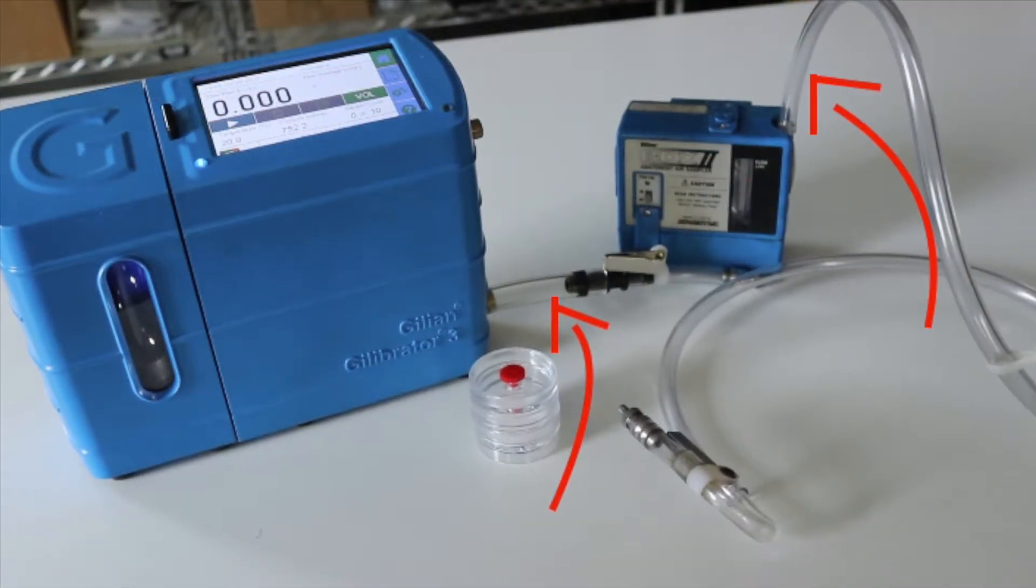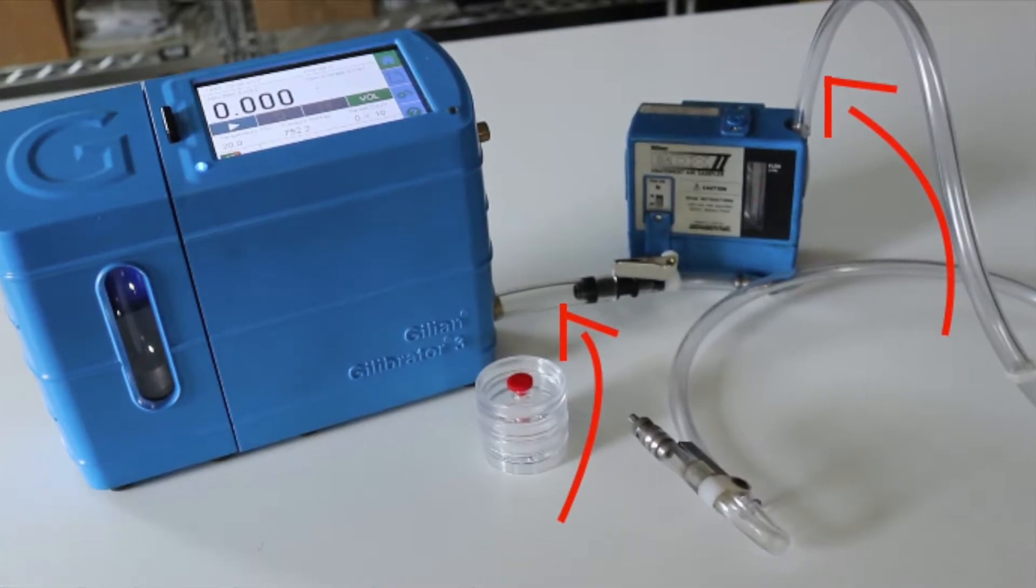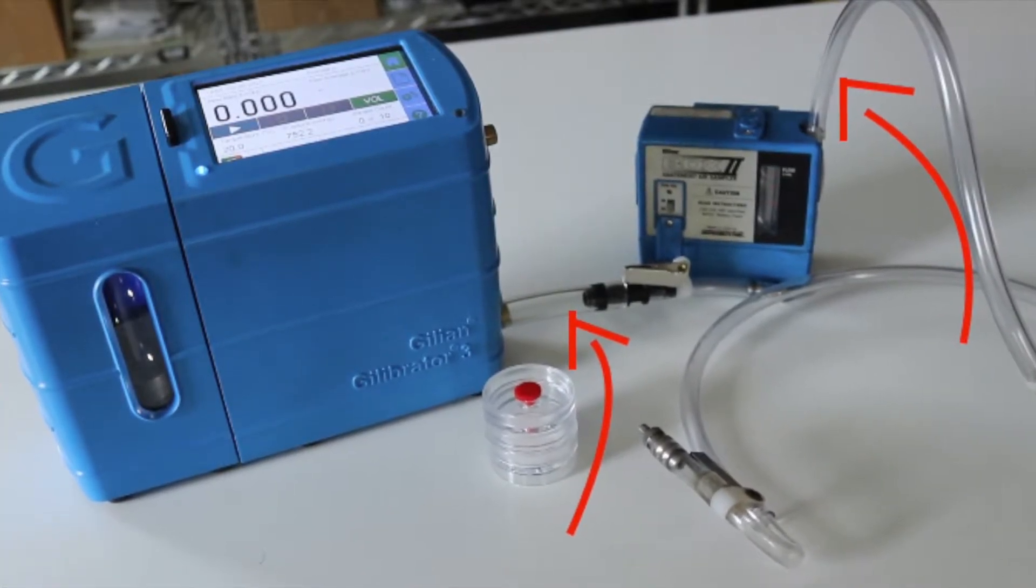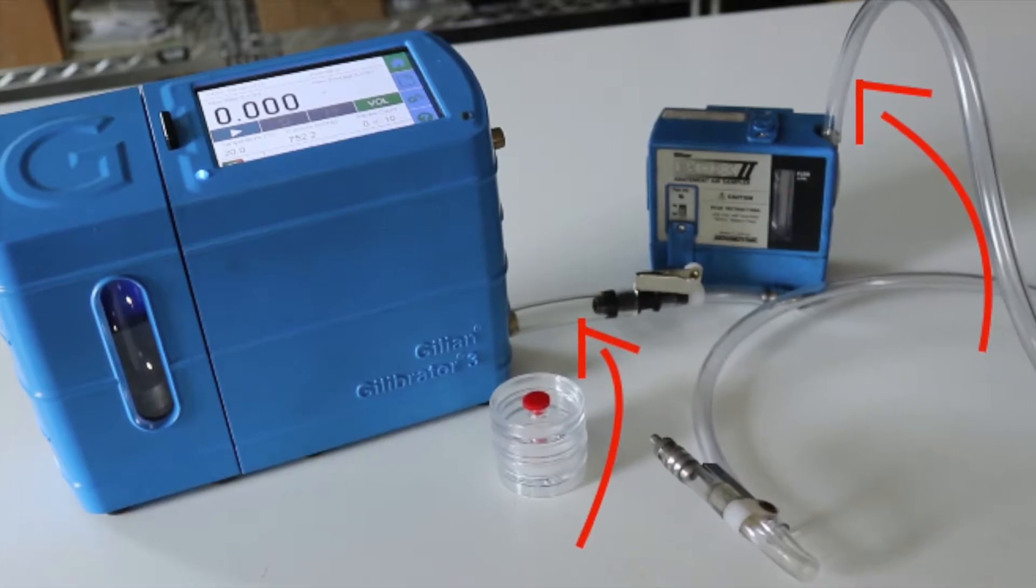At this point, you should have the calibrator connected to one flexible tube and the sampling pump connected to another flexible tube.